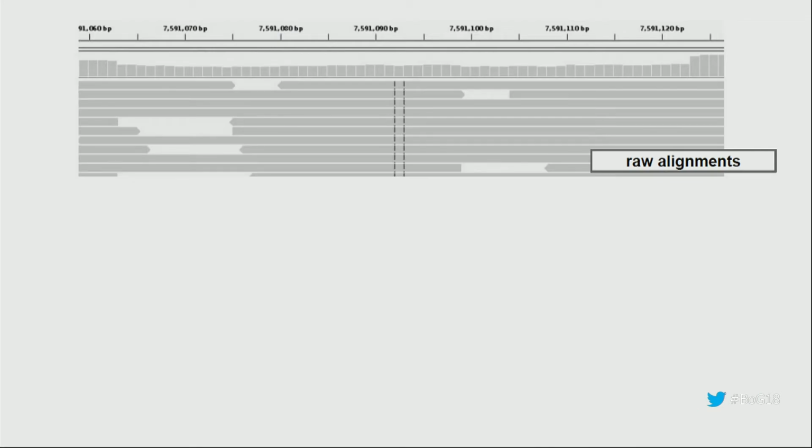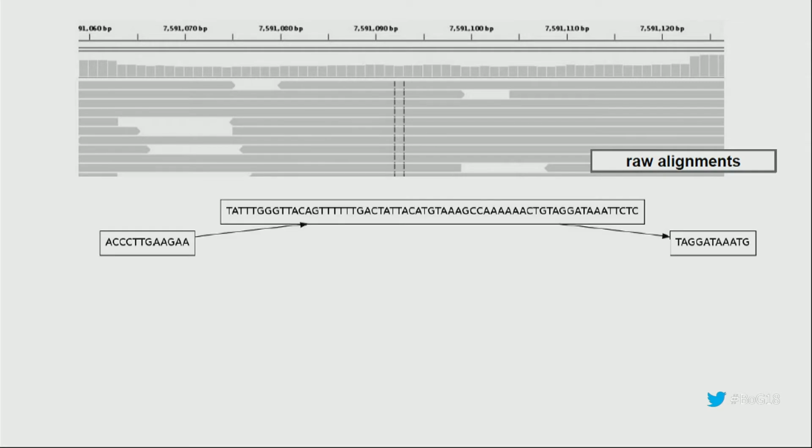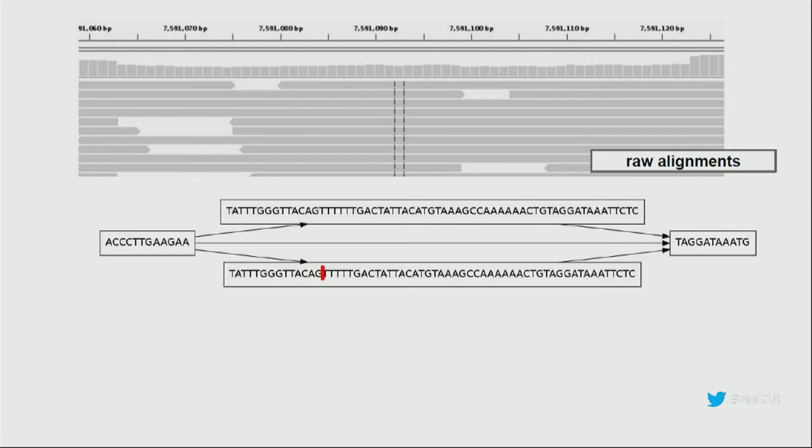It's from the 1,000 Genomes project. There's a locus, which we found, where there's no real evidence for variation in the primary read data. But if you take a variety of different variant callers, which can build assemblies, you can see that there are three particular alleles at the locus. There is the reference allele, of course, which is matching all these reads. Then we have a large deletion. And also overlapping this is a small deletion of a single base pair.